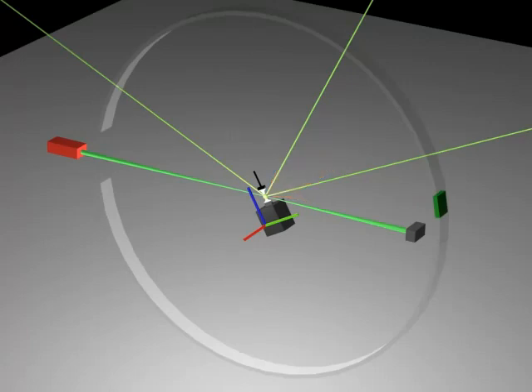A point-like detector is shown in the current configuration. It measures intensities over a small angular range. As such, a point detector collects data along a single scattering vector. When a monochromatic beam hits the sample, it is diffracted among discrete directions governed by Bragg's law.